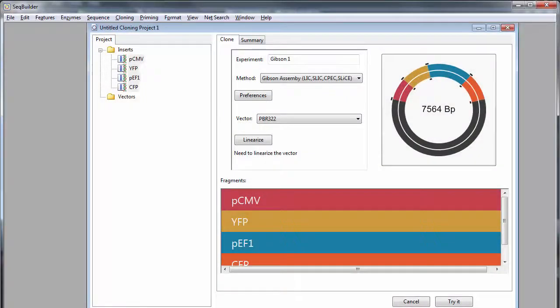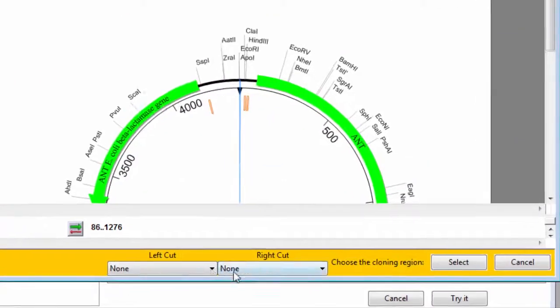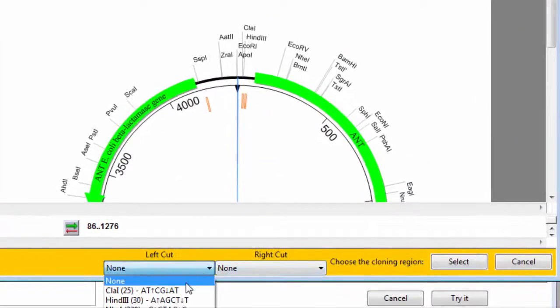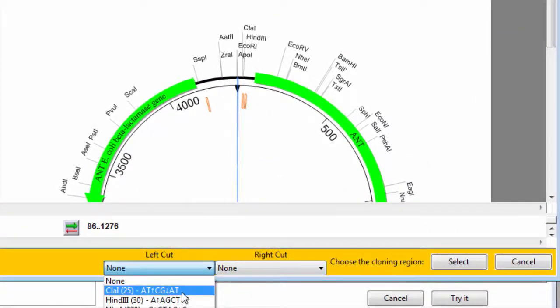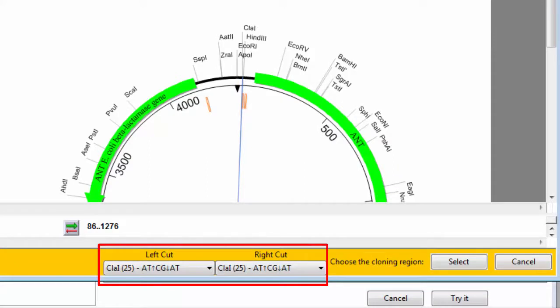If necessary, linearize your vector by clicking this button and choosing Cut Sites. The menus here will automatically include only those enzymes that are unique in the vector and which will not cut the inserts.